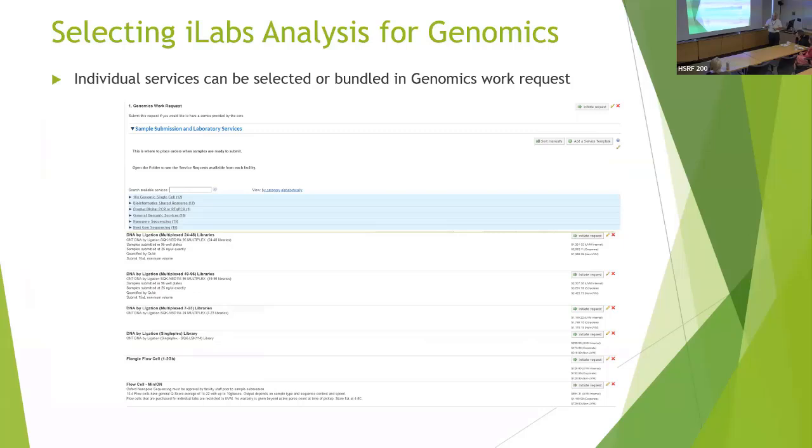So we're a little bit different. Most of what you've been hearing are cell-based assays. Microscopy imaging does cell-based assays. Roxana does cell-based assays. We're a genomics core, you submit samples to us, usually DNA or RNA. So safety training isn't something that we have to worry about because we're handling nucleic acids when you bring them into the lab with the freezer.